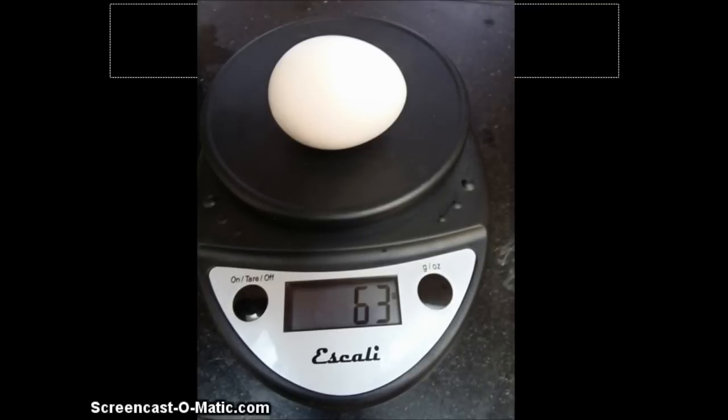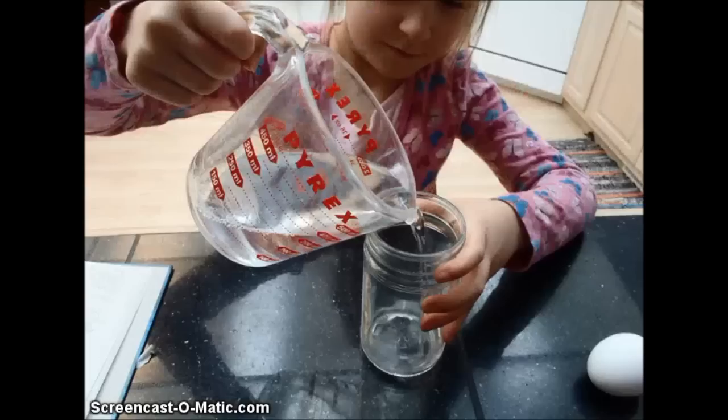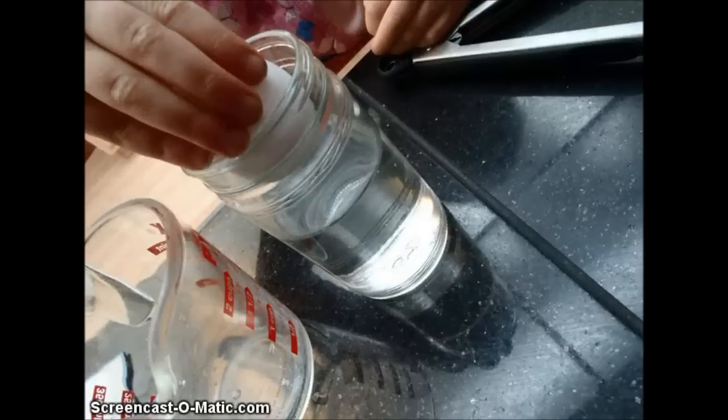Weigh your raw egg in grams. Measure 250 milliliters of vinegar. Pour into a clear cup. Gently immerse your egg.